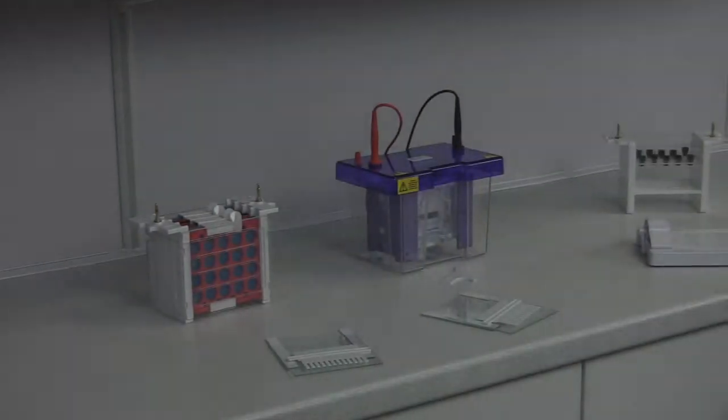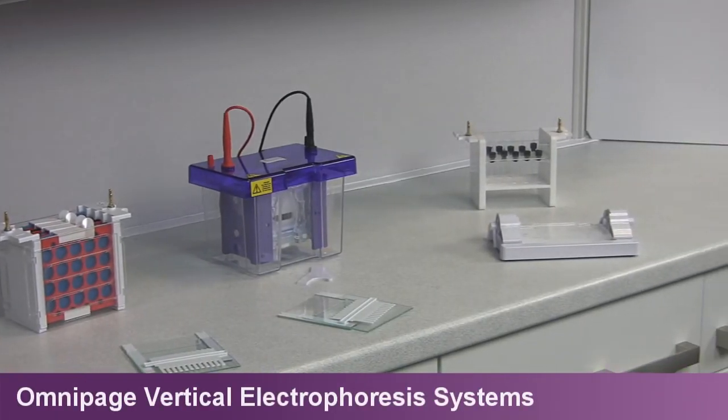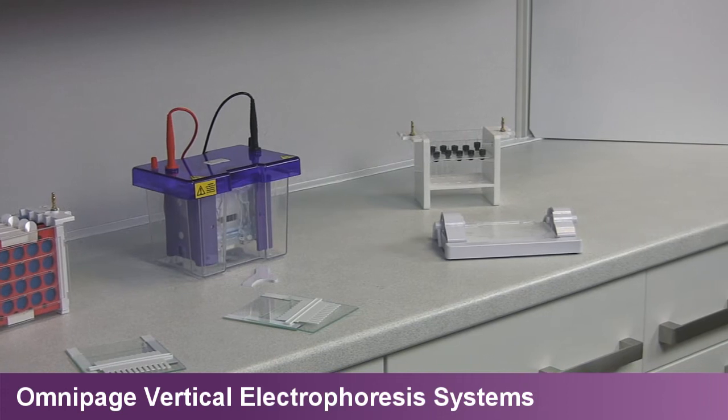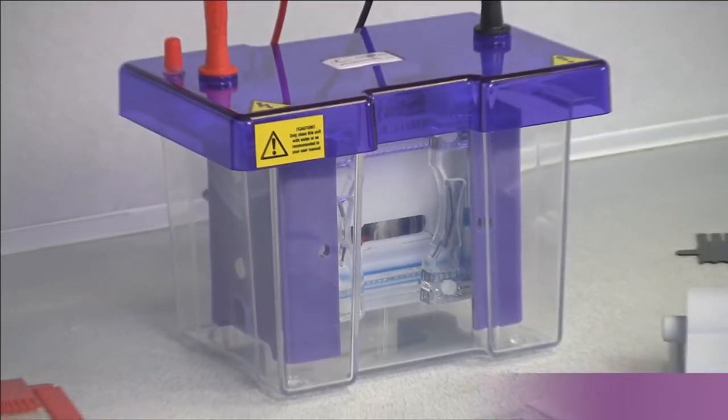Cleaver Scientific provides a comprehensive range of omnipage vertical systems for all your protein electrophoresis needs. The most popular size format is the Omnipage Mini for 10x10cm gels.